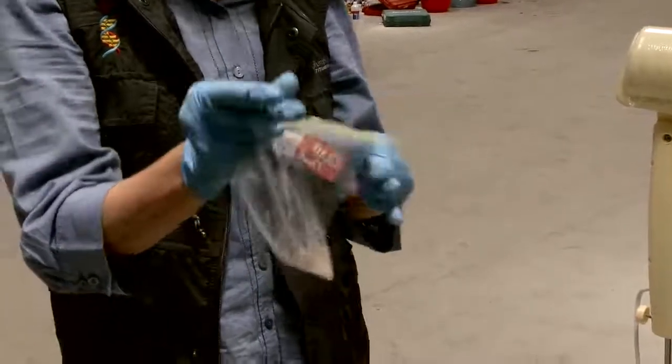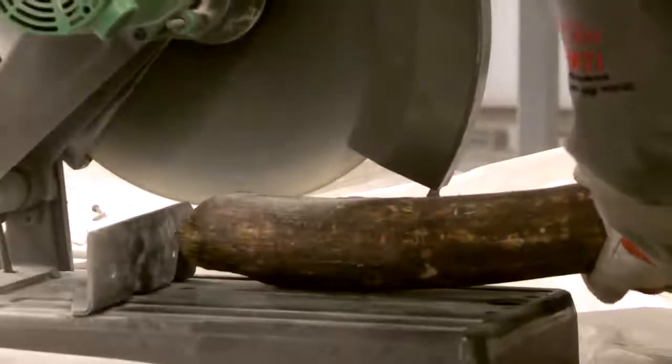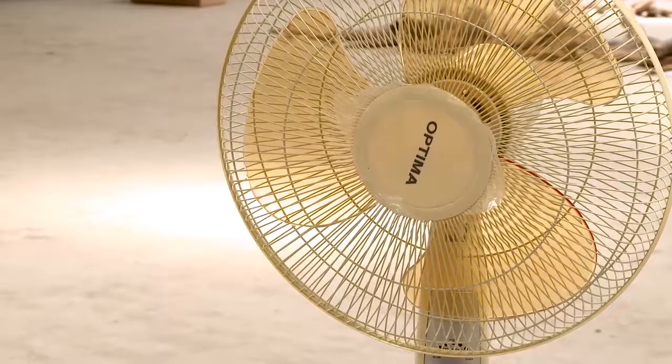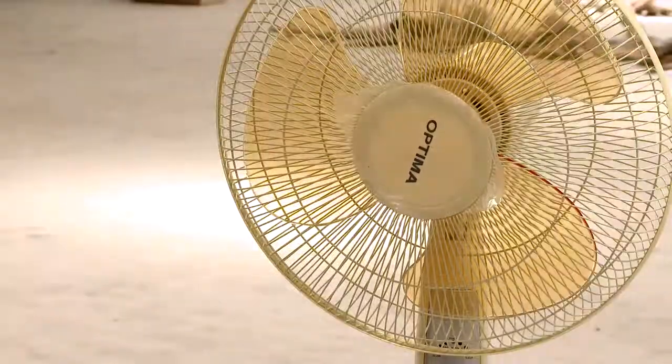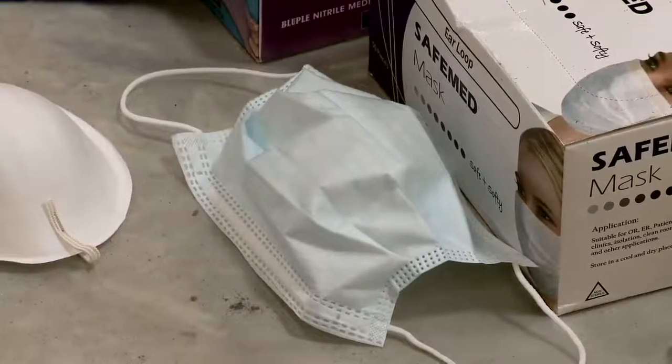When cutting the ivory, there will be a lot of dust. If you are in a closed environment, it might be helpful to use fans to blow the dust away from your group. Always wear a mask when the ivory is being cut.